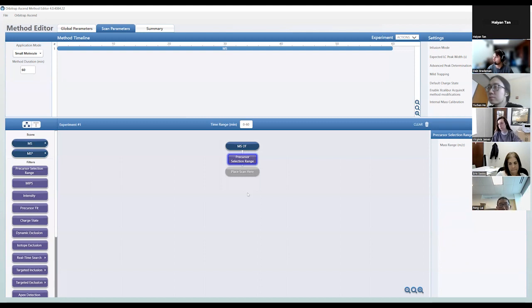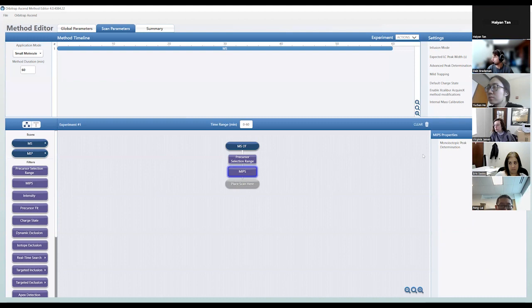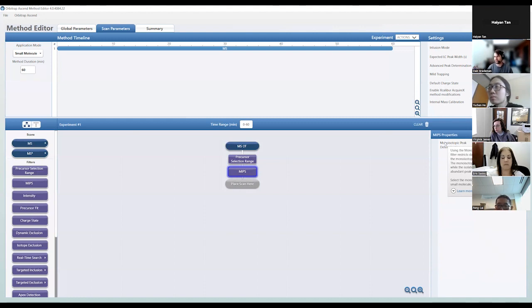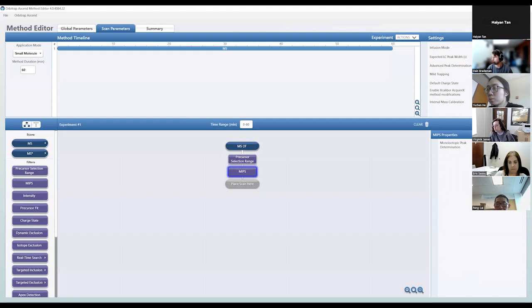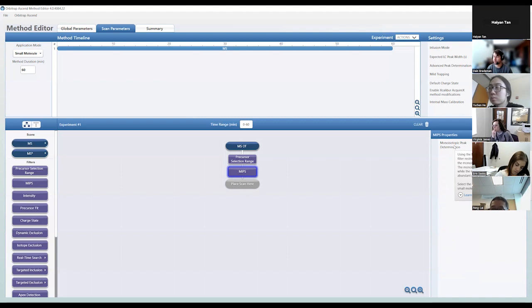The next thing I drag over is the MIPS node — Monoisotopic Precursor Selection. This is a heuristic algorithm for detecting monoisotopes based on isotopic distribution weighting. Peptides have a different isotopic distribution than lipids, so if you use peptide mode for monoisotopic peak determination you might not always get the right monoisotope assigned. So if you're running in small molecule mode, you almost always want to set monoisotopic peak determination to small molecule mode as well, which allows you to pick out the monoisotope more reliably.